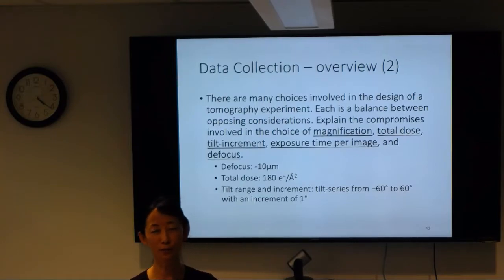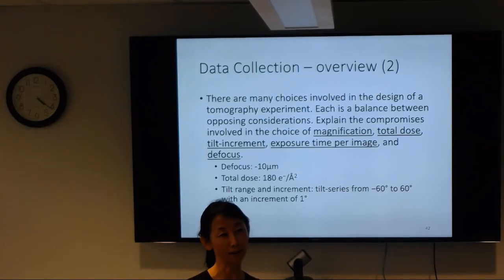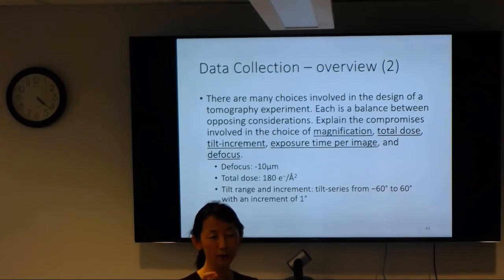Also, is it really necessary to go very, very high mag? What is the current resolution of a tomogram of a region of a cell? How much can you see? Is it necessary to zoom in to look at one microtubule? Will you be able to resolve that after data processing? It also depends on your target.